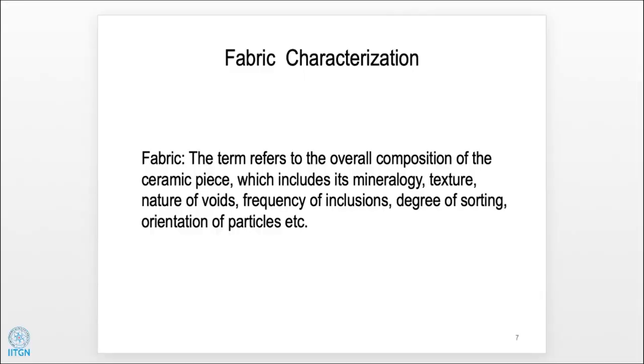Now what I want to tell you is that when you look at the thin section, there are two things that you are looking at. One is a matrix. That is the clay part which has undergone certain changes, and then the non-plastic material. So the plastic material and the non-plastic material. Within the non-plastic material, you have mineral phases as well as non-mineral phases. In the mineral phases, you have different minerals and rock fragments. The non-mineral phases means crushed pottery, which we call grog. Then you also have voids where certain organic materials are there.